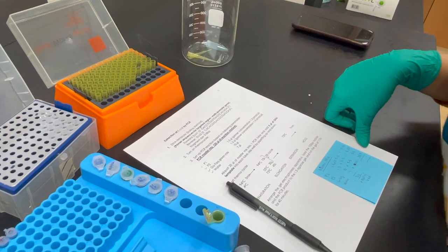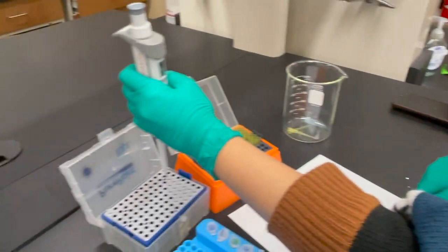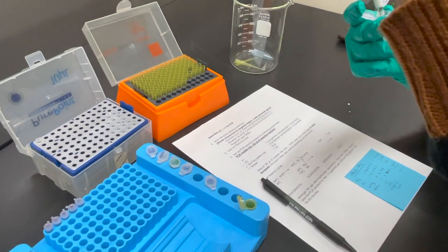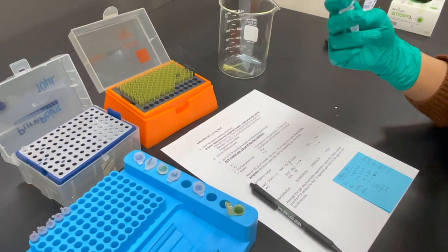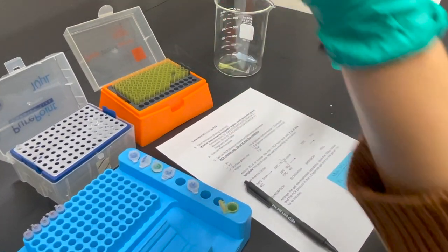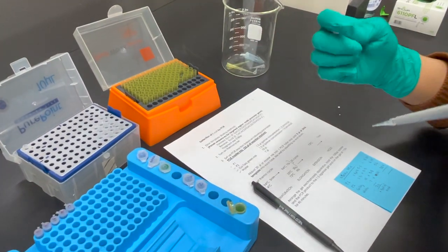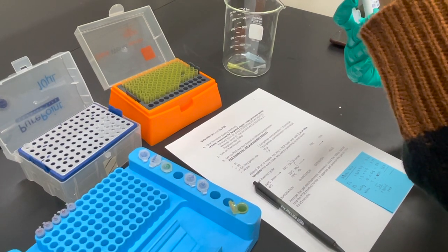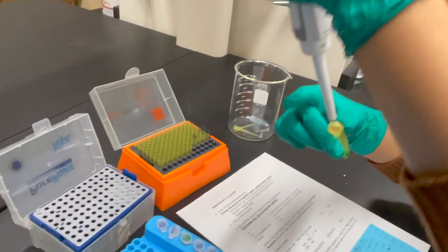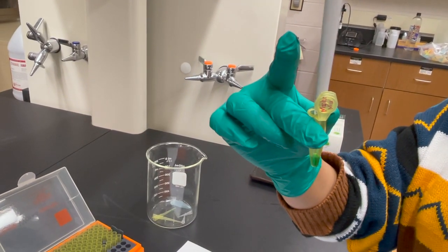Now we add both primers at the end. For each primer we need 8.25 µL, so we add P1, the forward primer, followed by P2. This is the final master mix we have prepared. We will vortex and spin it for a few seconds before distributing it into individual PCR tubes.